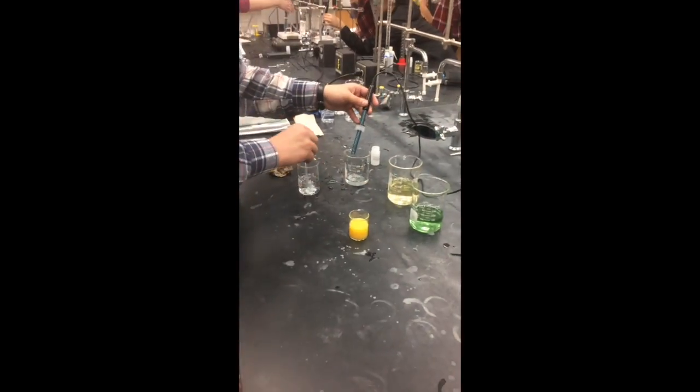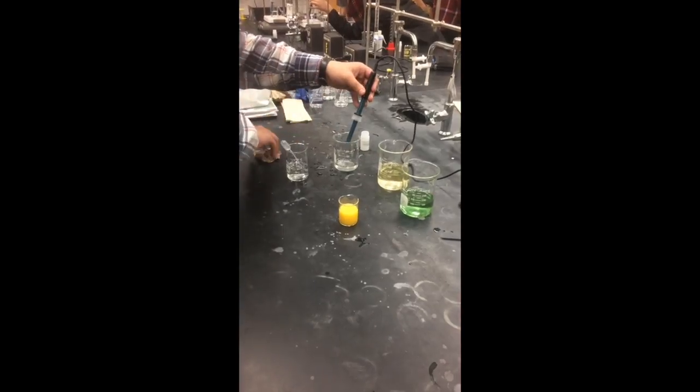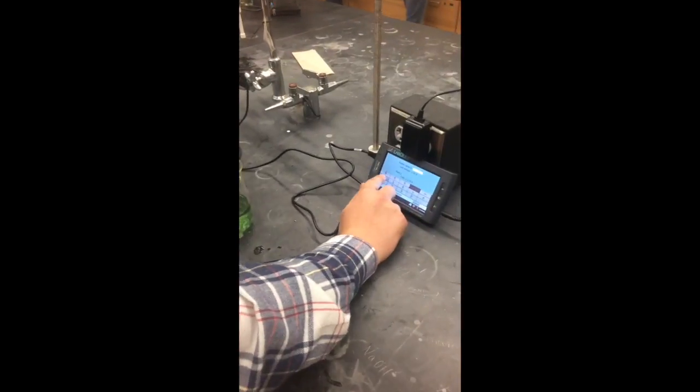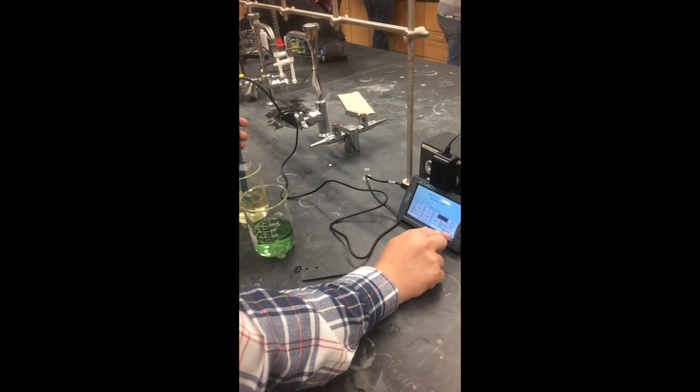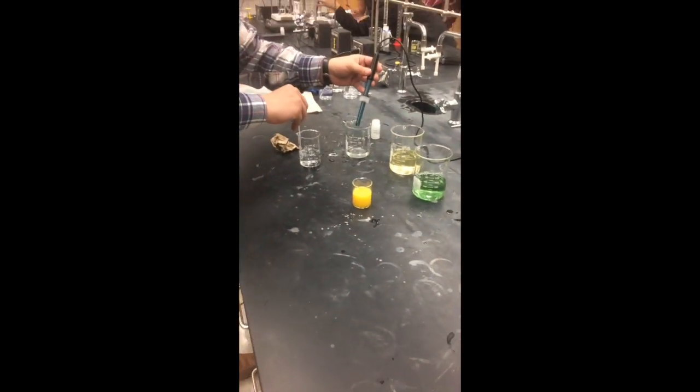Wash again. This water must be deionized. Then put in a pH 4 solution and calibrate again. Wash again with deionized water and blot dry.